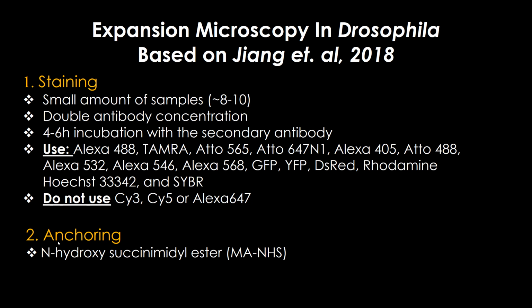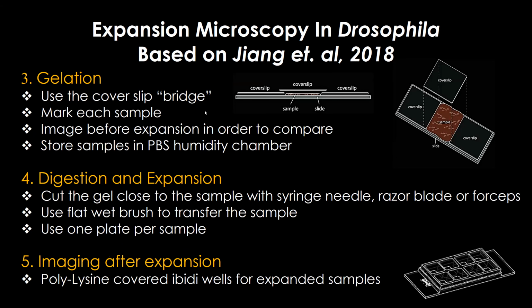In this protocol, I anchor using MANHS, which is the ester that has an acrylate group on one side and an ester group on the other side. It binds from one side to the proteins, and from the other side to the gel. Next step is the gelation step.